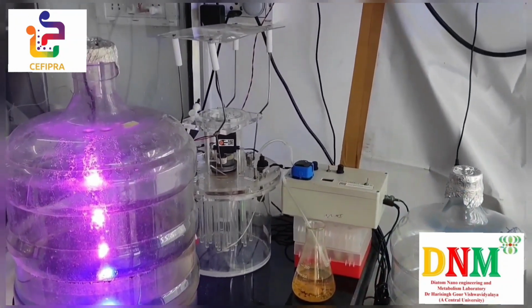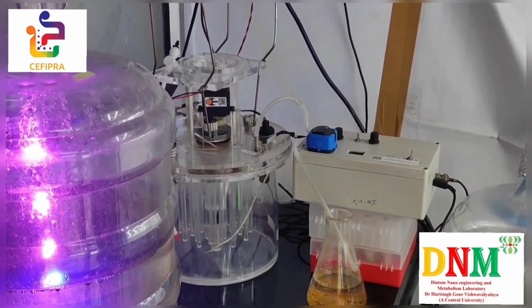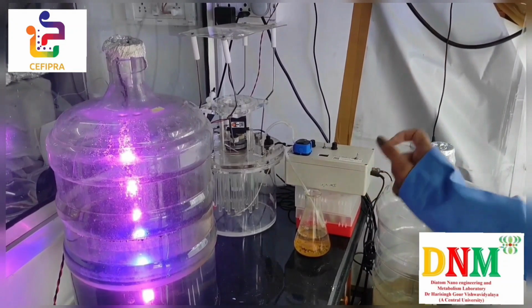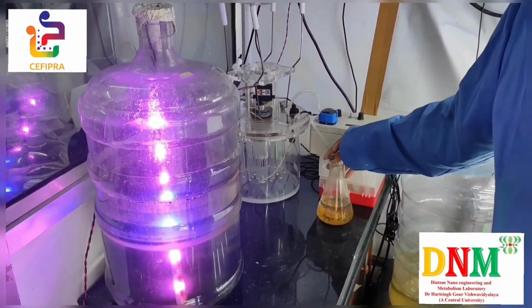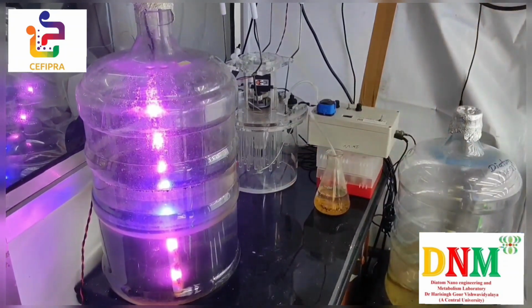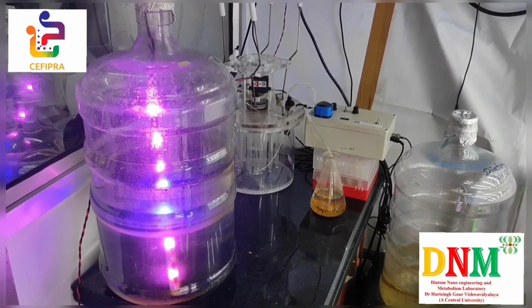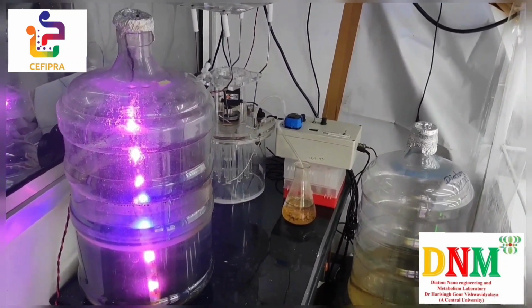It is actually an upscaling device of what we made on a 2-inch wafer at IIT Bombay. So this is a resonating device for which we have filed the patent, which takes the diatoms or the microalgae, and these are the pillars which are giving a mechanical shear strain on the cell wall of the microalgae and letting them ooze their content or harvest their value-added products.